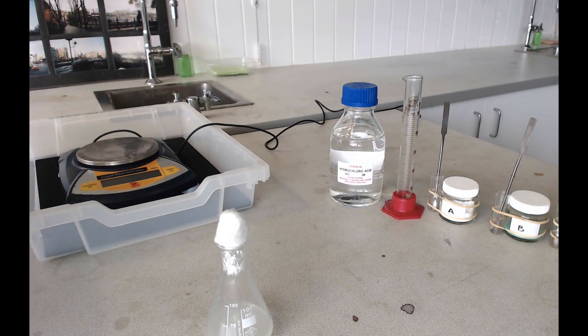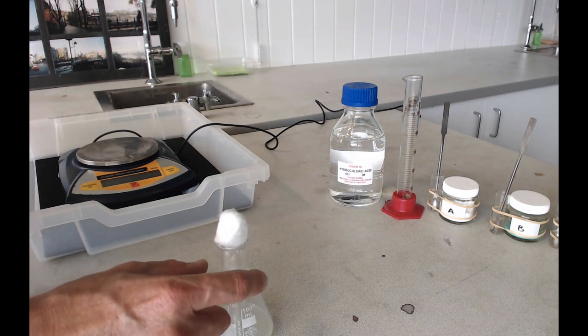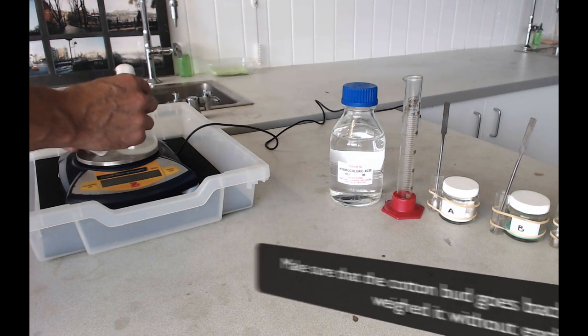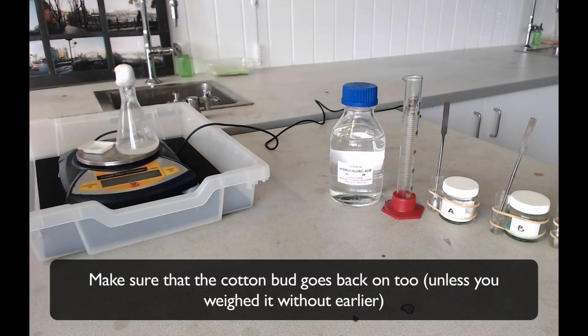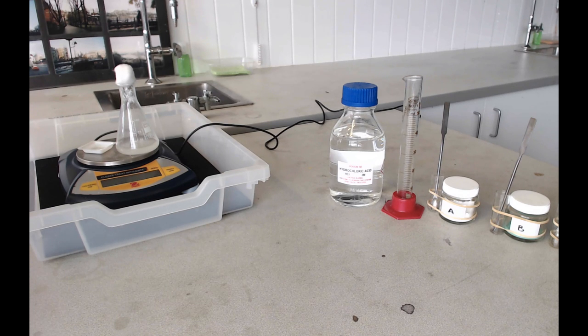Once all your solid is finished reacting, so you can't see any of it left, you just need to put everything back on the balance, so that includes the weighing boat. You can now see how much weight it lost, and that weight that it lost will be down to the carbon dioxide that it gave off.